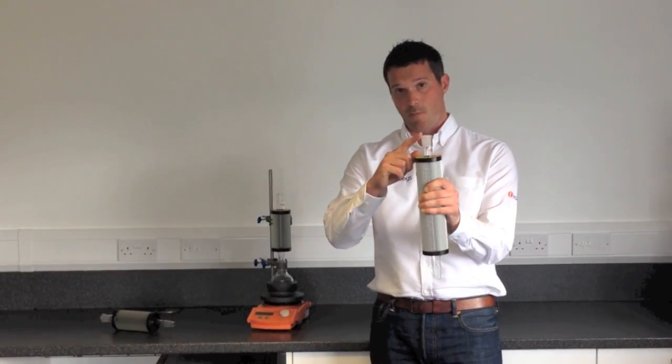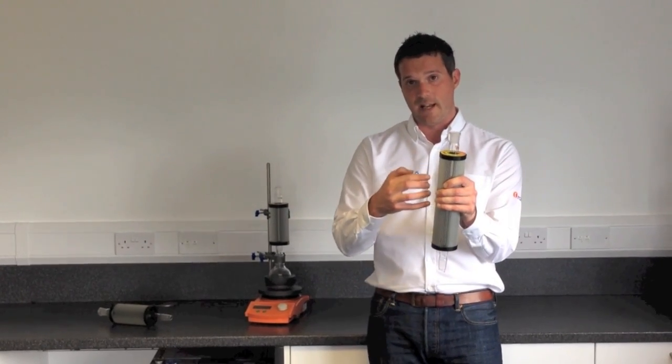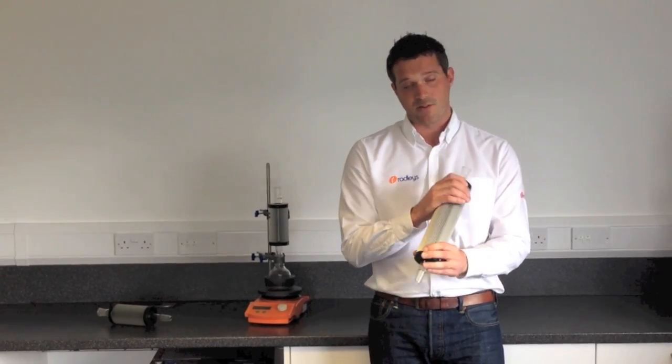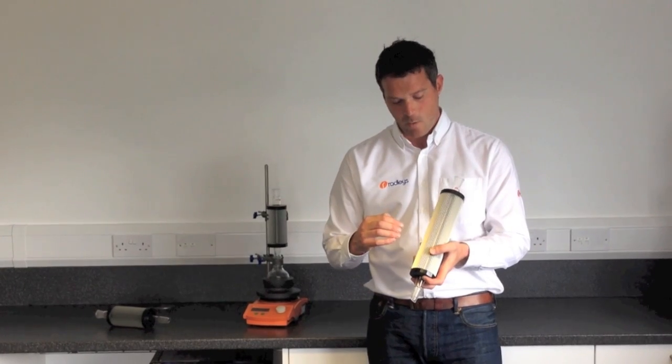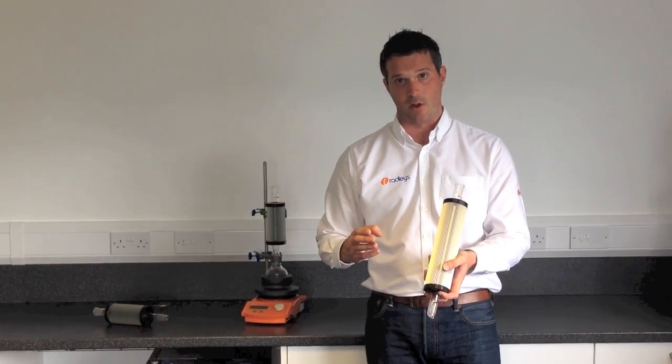Inside the Findenser is a glass tube that runs right the way down the centre. It's a Vigreux type column so there are lots of indentations inside — lots of surface area. Outside is an aluminium jacket which has fins and ridges all the way around, so there are lots of surface area on the outside too.